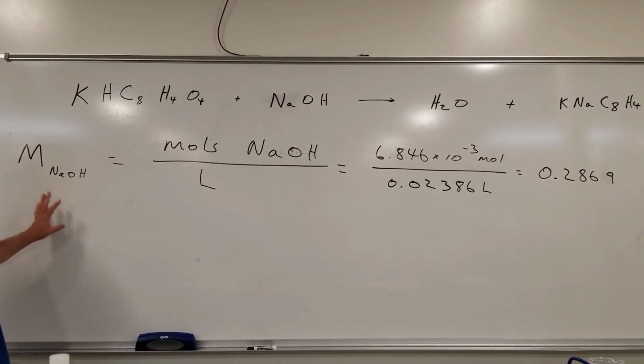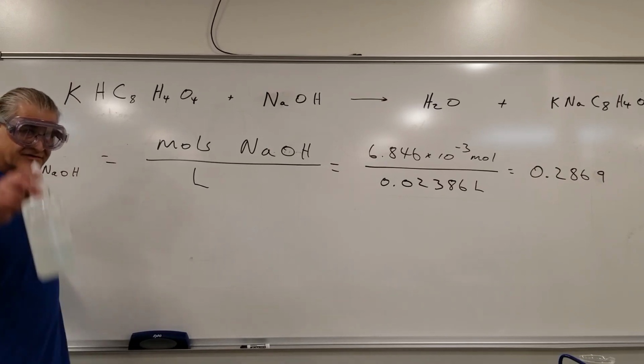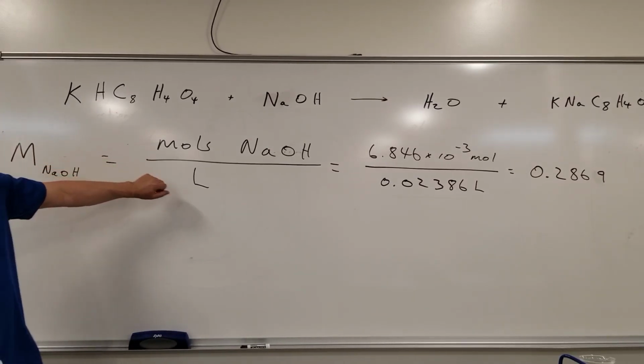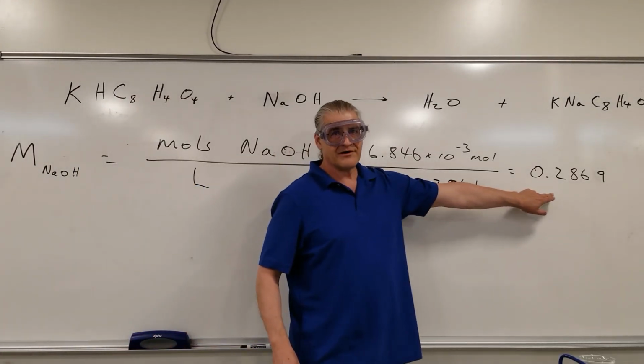Okay, so again, what we're after in this whole procedure, the reason we're doing the standardization, is we want to know the molarity of the sodium hydroxide, the molarity of this solution. We know the moles, we know the liters. Simply divide moles by liters, and you have the molarity.